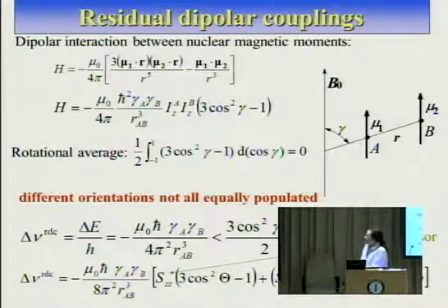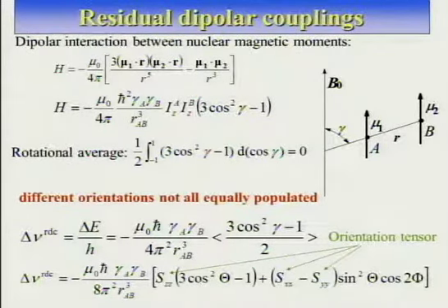Now, if you have this magnetic susceptibility anisotropy, as I was mentioning before, you get different magnetic moments depending on the orientation of the protein with respect to the magnetic field, and so also the energy of interaction between the protein magnetic moment and the magnetic field is different. So basically, you have different energies depending on how the protein is oriented in the magnet with respect to the z-axis, which means that you don't get an equal population of all the orientations, but you actually have favored orientations with respect to the field.